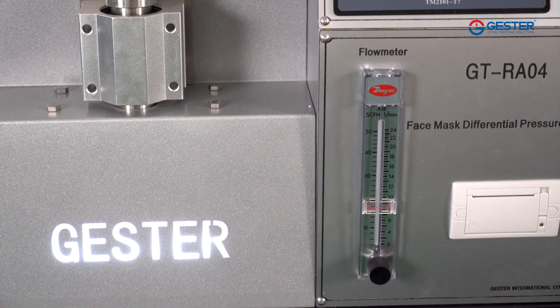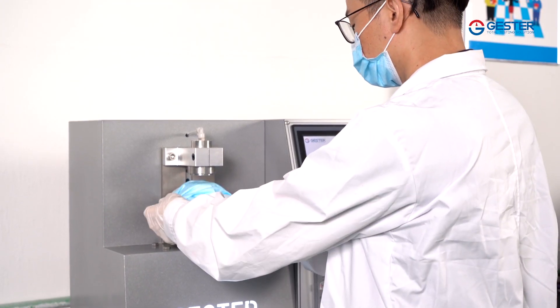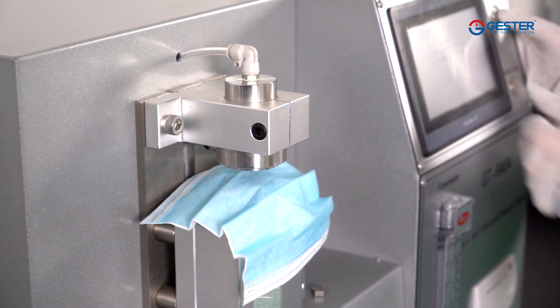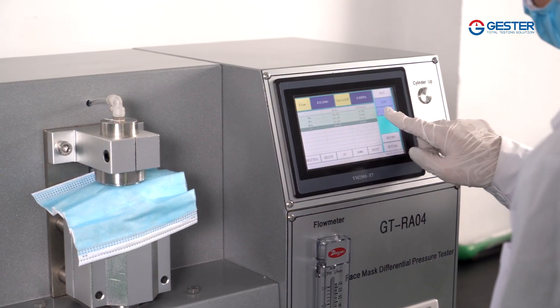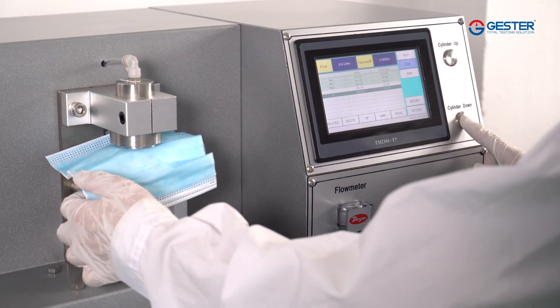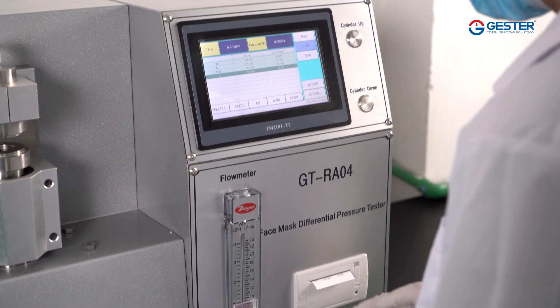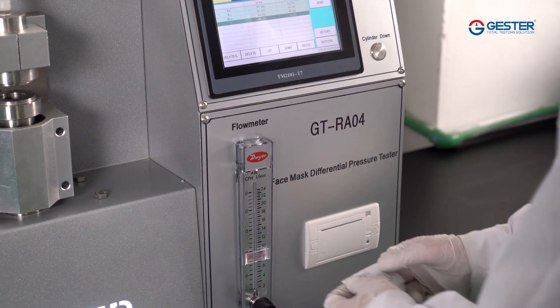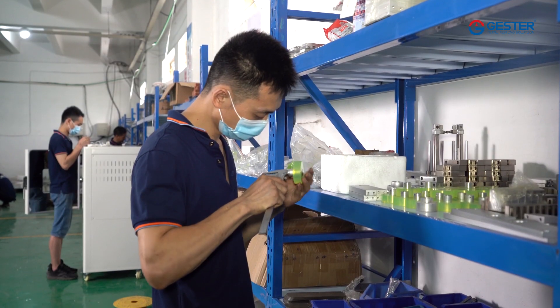Features: 1. Stainless steel clamp. 2. Pneumatic clamping — more tight. 3. English operation. 4. With printer printing English results. Standards: BS EN 14683, ASTM F2100, YY 0469 section 5.7, YY/T 0969 section 5.6. Range of differential pressure sensor: 0 to 500 Pascal. Control mode: 7-inch touchscreen.